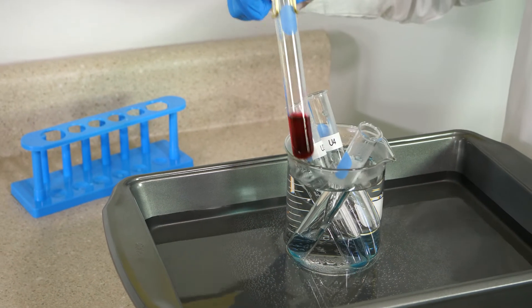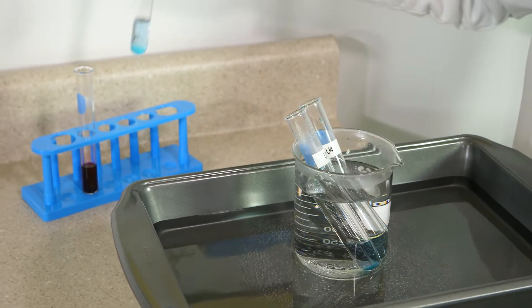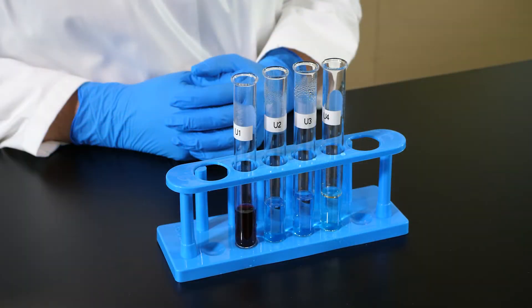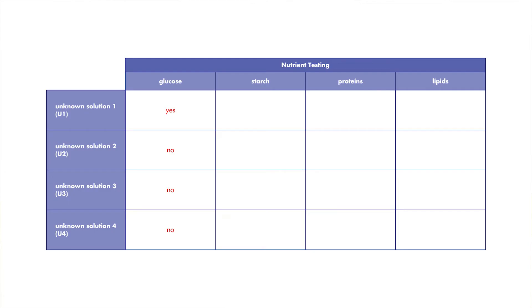It is time to remove the test tubes from the water bath and place them in the test tube rack. Let's examine the results. Remember, if glucose is present, the solution will turn red. We see that unknown solution 1 turned red, which indicates that glucose is present in the solution. Since none of the other solutions reacted, we know that glucose is not present in those solutions. Record your observations in your lab journal.